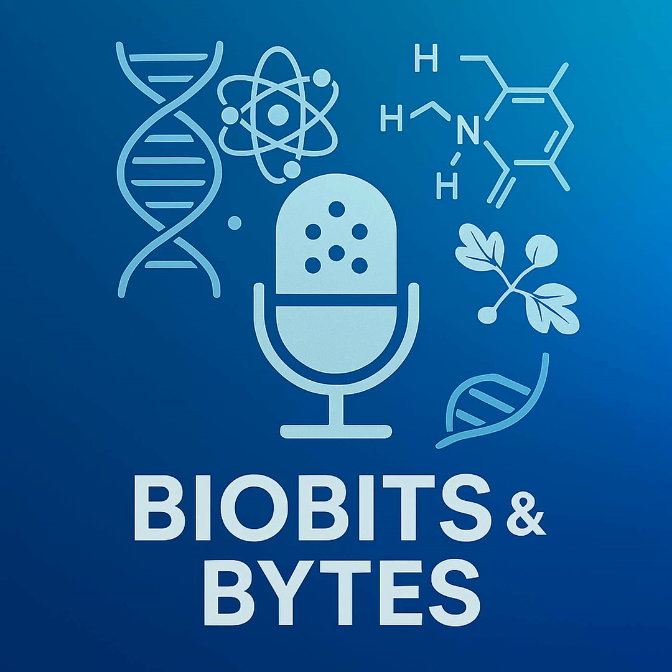You introduce labeled probes. The things that find the specific sequence. Exactly. These are single strands of DNA or RNA designed to be complementary to the target sequence you're hunting for. And they're tagged, maybe with a radioactive atom or a fluorescent dye or something that glows chemically. And these tags then hunt down their matching DNA on the membrane. They do. You give them time to hybridize. That's the scientific term for binding to their complementary sequence. Then you wash away any probes that didn't find a match.